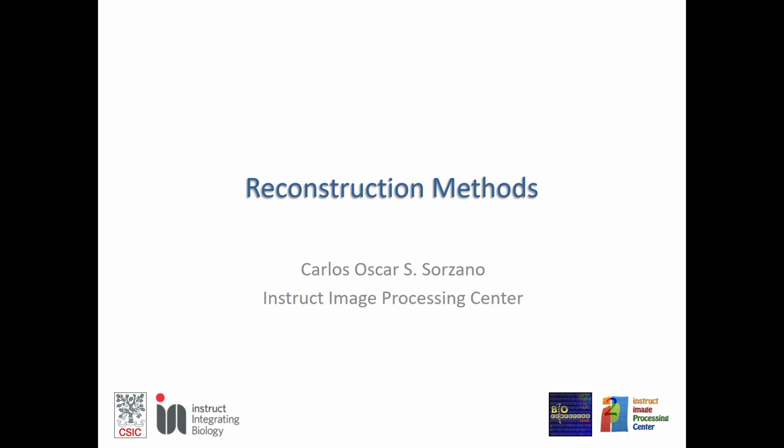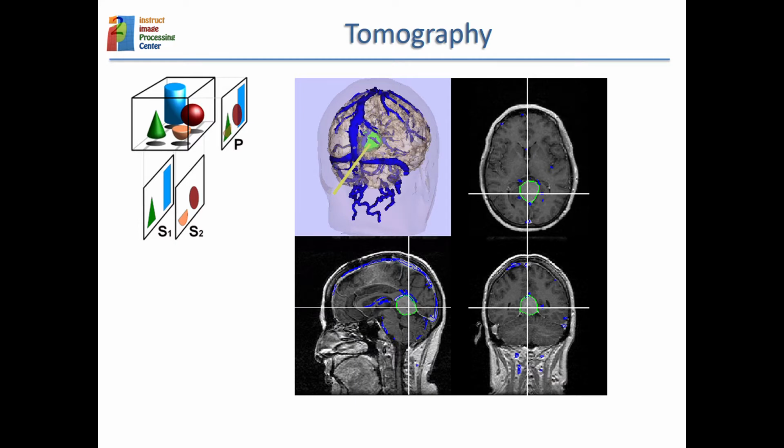So in this lecture we will see a little bit of the ideas behind the 3D reconstruction methods. I have borrowed many of these slides from a more mathematically oriented presentation, but I will not get into the mathematics this time. So let's see some of the ideas.